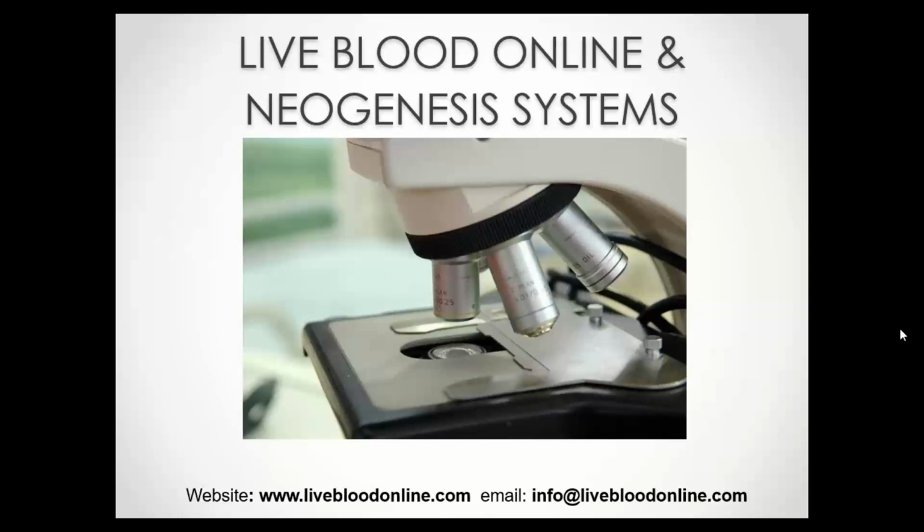It really just involves preventing dust from getting into any of the essential components. So the way that the microscope is built, unless you disassemble the system, dust won't really get into anything. The lenses are sealed, everything is set up so that it works the way that it should. But if you feel that it needs to have a proper setup again, if some of the settings seem like they've gone out and you're not able to set it up with our instructional videos on how to do that, then there are service centers available.